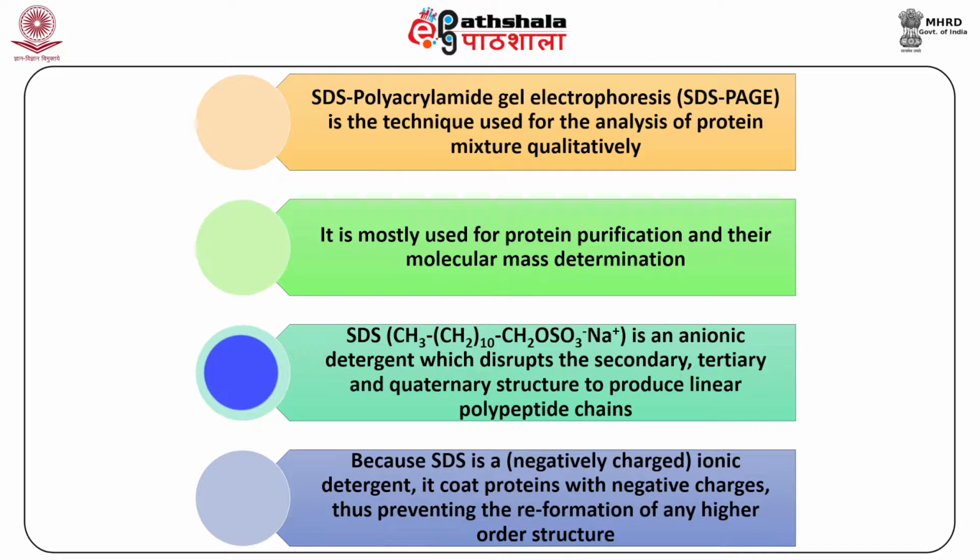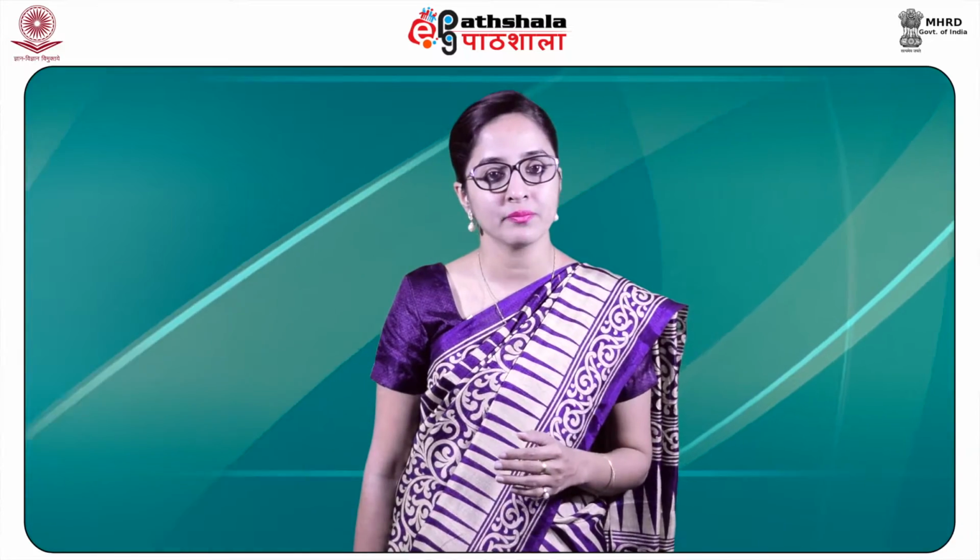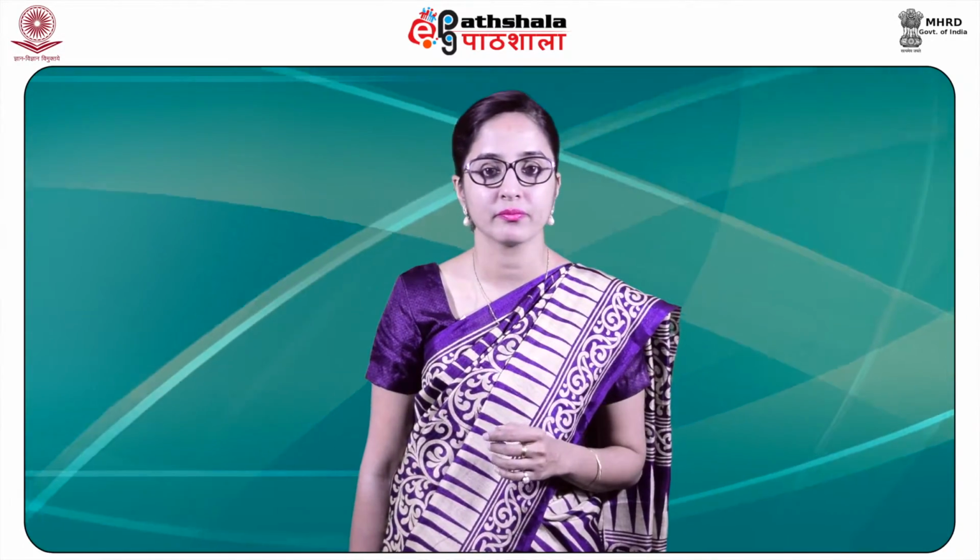SDS is an anionic detergent which disrupts the secondary, tertiary and quaternary structure to produce linear polypeptide chains. Because SDS is a negatively charged ionic detergent, it coats the proteins with negative charges, preventing the reformation of any higher order structure. SDS is added to the gel as well as to the sample.